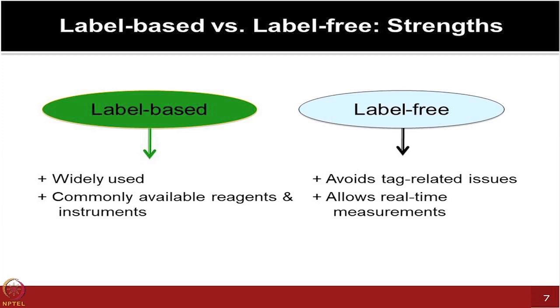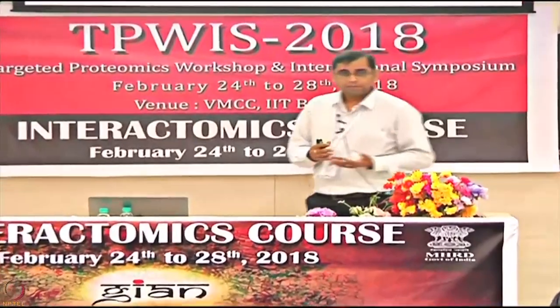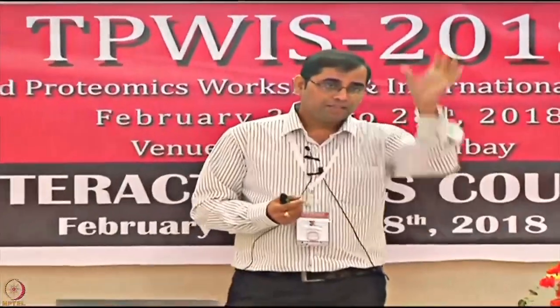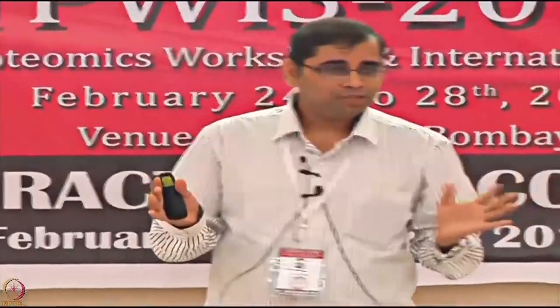However, the label-free platforms avoid the tag-related issues which you observe in the case of label-based. Most importantly, you are actually monitoring the biomolecular interactions in a real-time manner. And that's pretty powerful, because all the protein microarray technologies are great, but it takes a whole day to do the experiment, sometimes even longer if you are doing blocking and all. And at the end of the day, only then you are relying on the scanner to show you whether your spots are lighting up or not, or you see some huge background, your controls did not work out, and you're hugely disappointed. But you had literally no control as the experiment progressed the whole day.